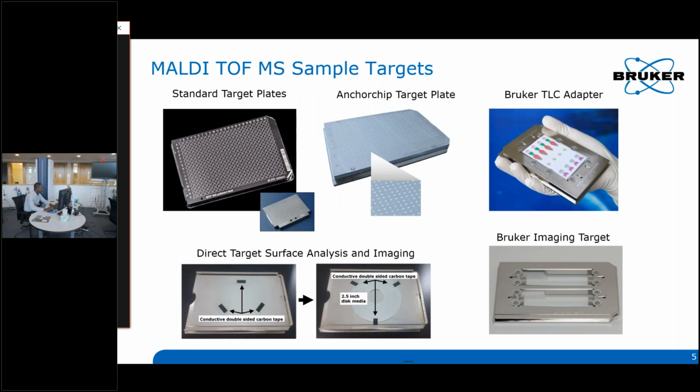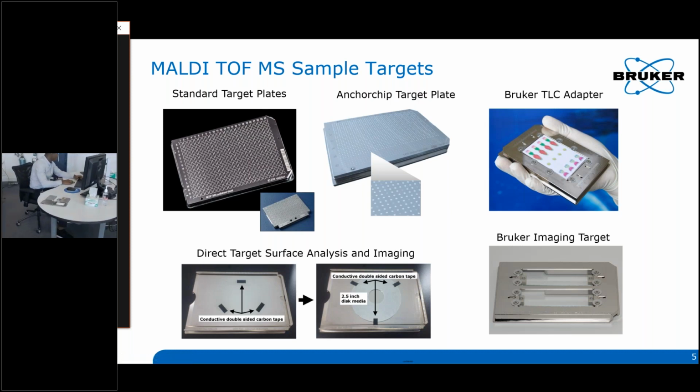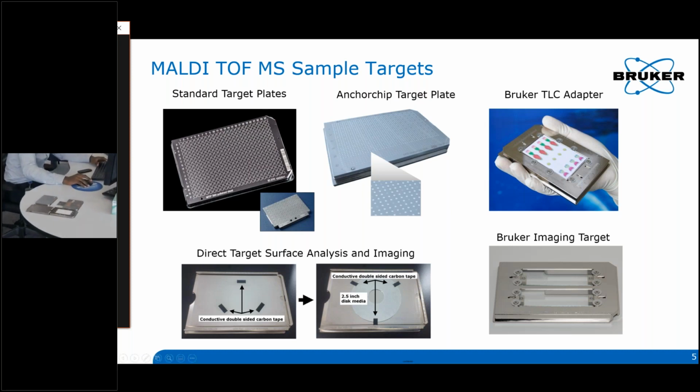So these are the different sample targets, and I have them right in front of me.